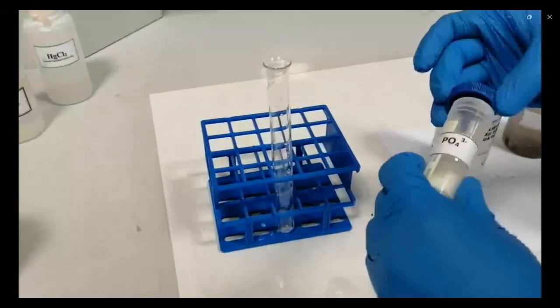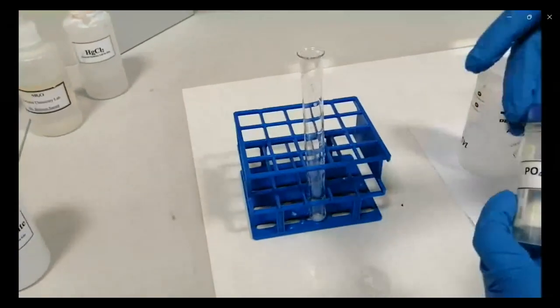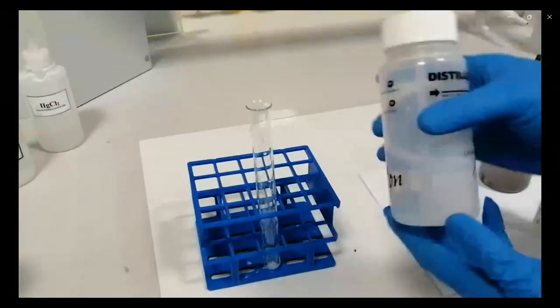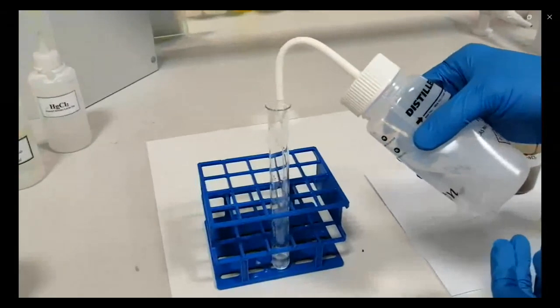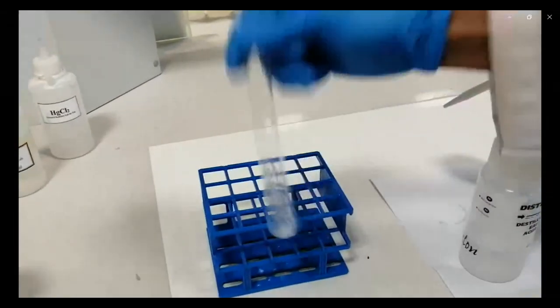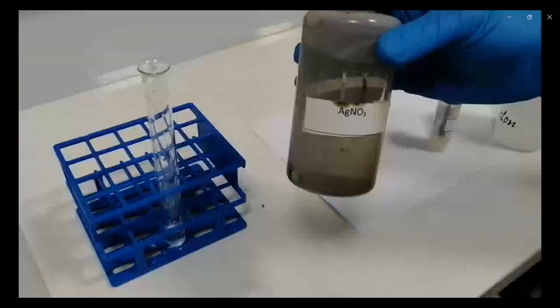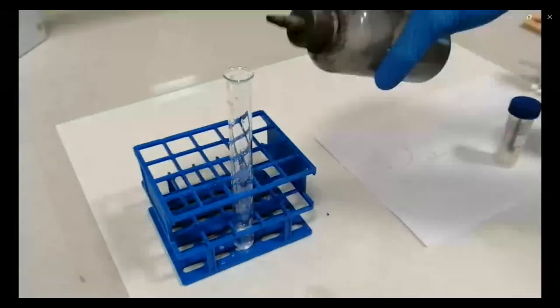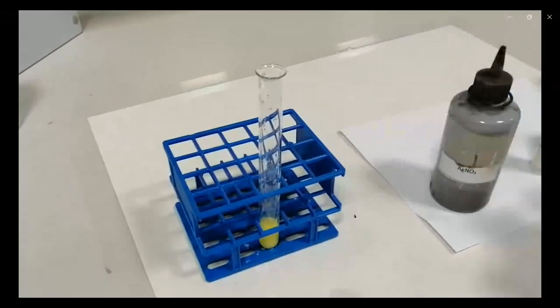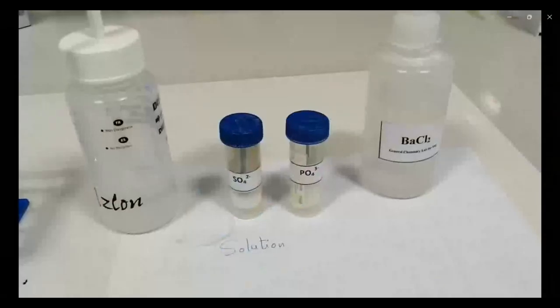The second one is phosphate. You have to prepare a solution of phosphate, a few crystals of the salt plus milliliters of water. Just mix them very well, and then add silver nitrate reagent. You will see a yellow precipitate. You can see the yellow precipitate. It's very clear.